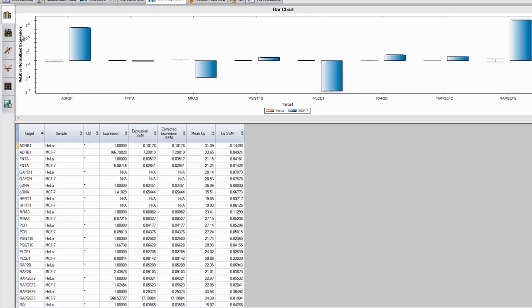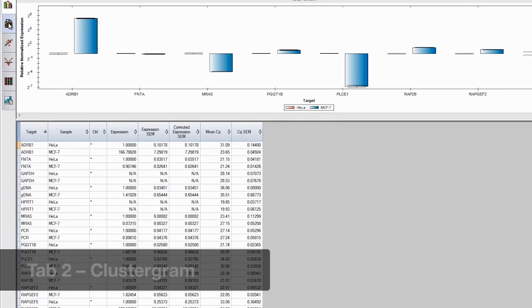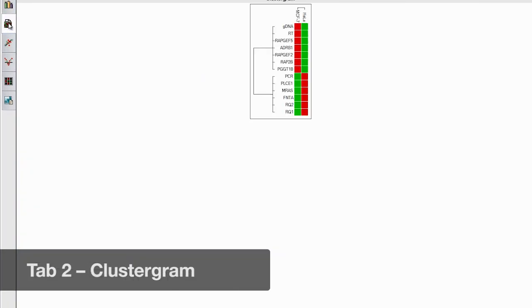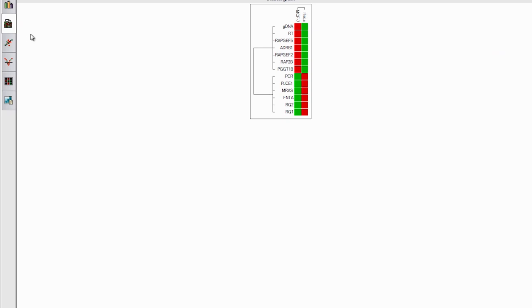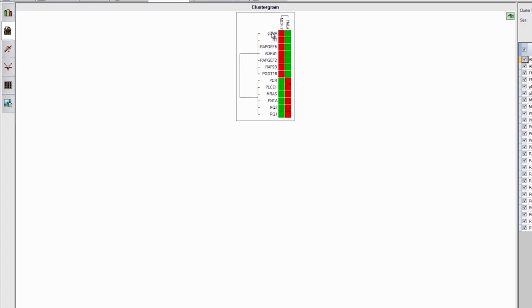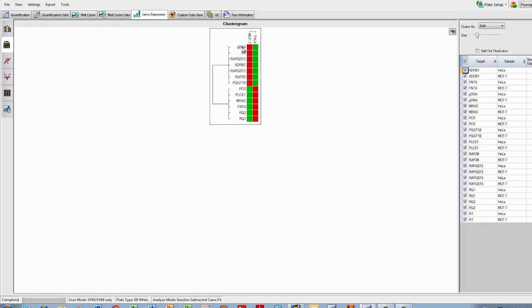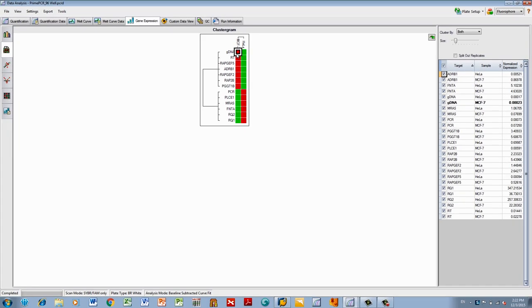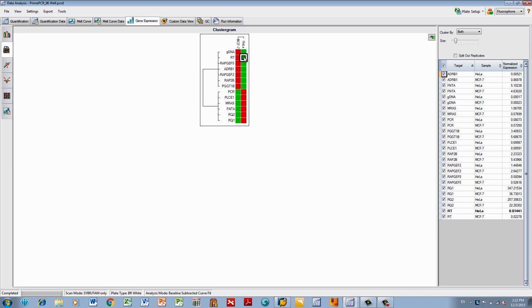The next tab in the vertical menu displays a clustergram, which shows data in a hierarchy based on the degree of similarity in expression of the different targets, genes, or samples. Samples that have a higher normalized expression are shown in red. And those with lower normalized expression are shown in green. Those with no expression change are shown in black. Samples with no value calculated are shown in black with an X. The lighter the color of the box, the greater the relative expression difference.